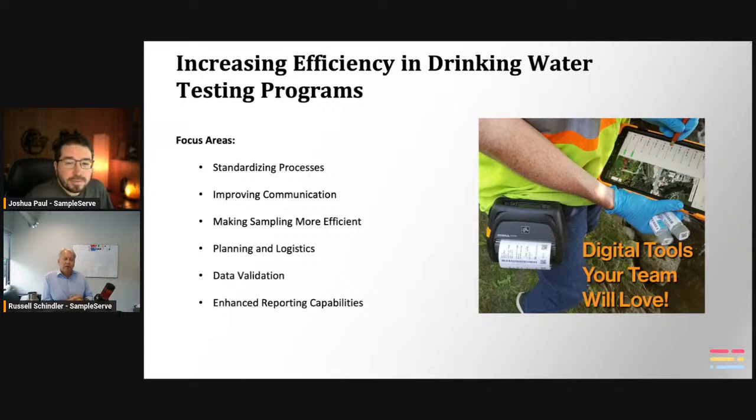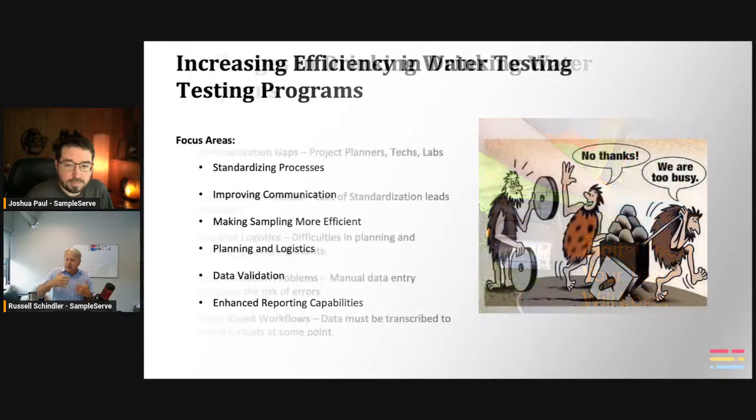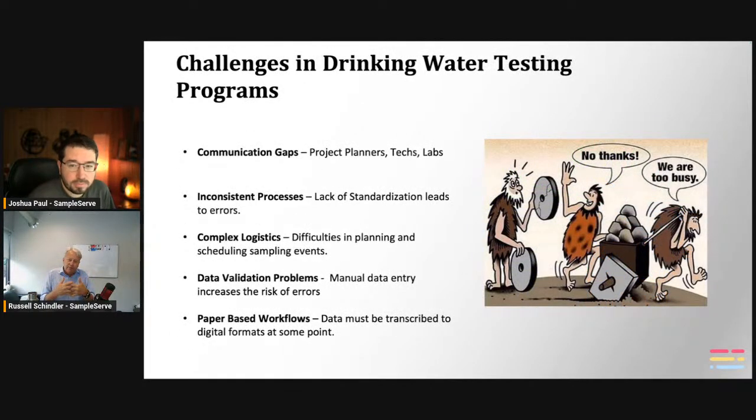Yeah, and one of the things that I'll add is that there's multiple laboratories that do this work, and we're able to deliver that data in a digital format to the various laboratories. Even some of the projects require split samples. Some of the analytical parameters are going to one lab, others are going to another lab. And so we've built the process to make that all very simple.